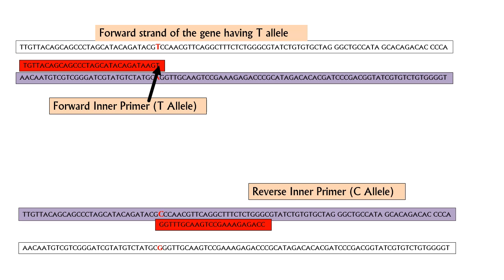It should be kept in mind, the reverse primers get attached to the forward strand, and forward primers get attached to the reverse strand, because the strands are formed opposite by the DNA polymerase enzyme because of the complementarity. So when it gets attached to the forward strand, it will amplify the reverse strand.